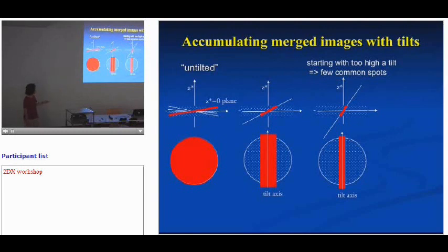So if you use something with very high tilt, the zone you can actually use for your origin refinement is a very small portion of the whole reciprocal space. As a result, you have a smaller number of reflections that you can use for comparison with your reference. So that's not going to work very well. You're not going to get a very good phase origin, particularly in this direction, as you can tell. So that's something that should not be done.